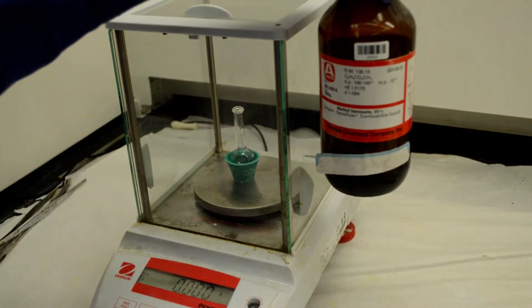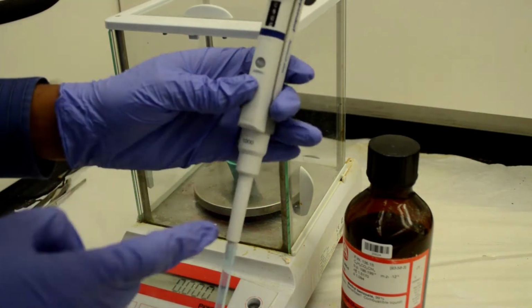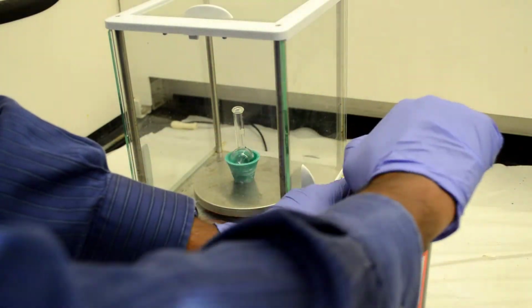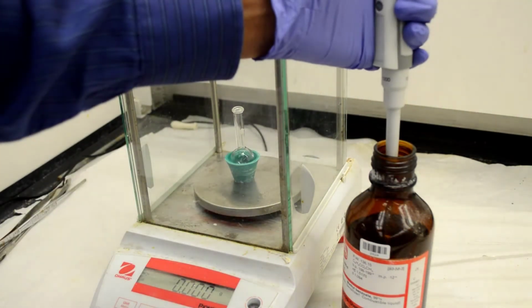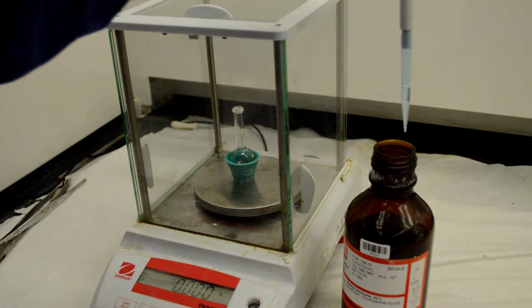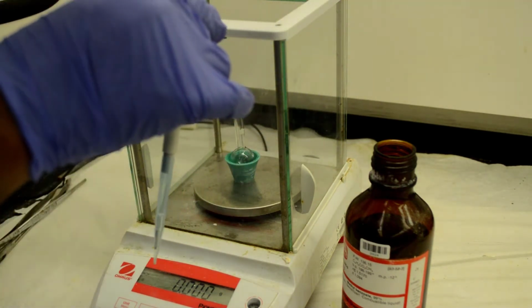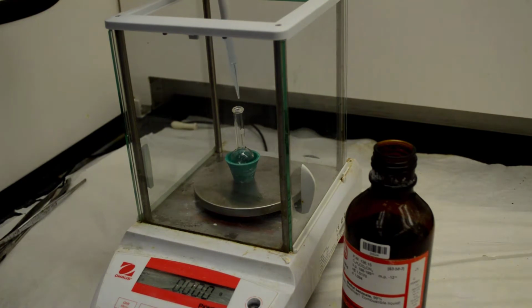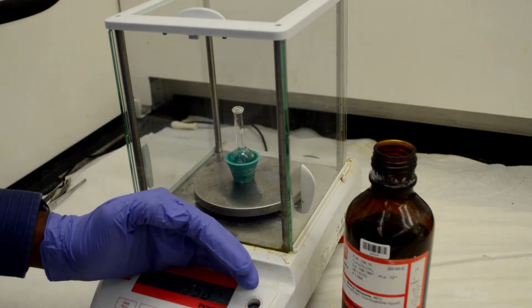Then I'm going to add the methyl benzoate, our reactant, 0.5 milliliter. Okay, 0.5 milliliter of methyl benzoate. Right, so let's add from the top. Now note down the weight of the 0.5 ml methyl benzoate. It is 0.558 grams.